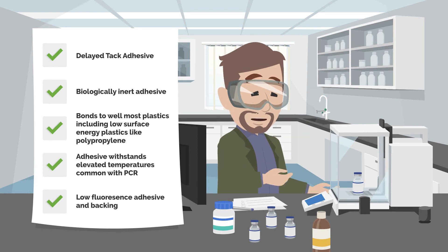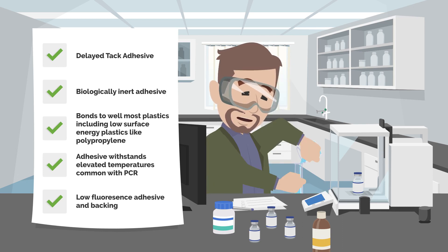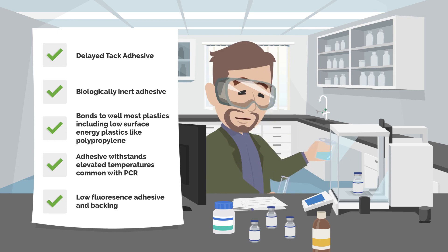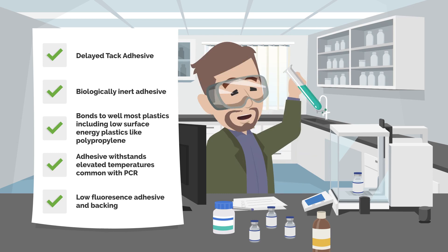The unique delayed tack properties of the adhesive allow some repositionability during assembly of devices. The tape construction makes it an excellent choice for many different kinds of applications, including those that involve PCR thermocycling. The material also contributes very little background fluorescence, which can be important when trying to detect certain compounds in samples with fluorescent indicators.